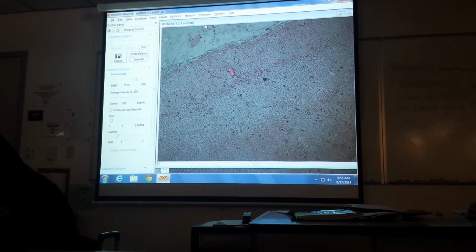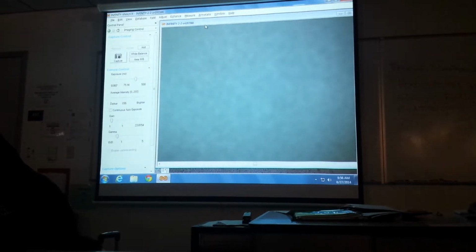Is this cortex or medulla? This is cortex. Which zone is that? Reticularis. What about that one? Fasciculata. These little oval clumps on the top. Glomerulosa. Okay. So what's that? Adrenal medulla. So you guys, at least some of you can see it, and some of you may take a little more time. But that's all I wanted to do for the adrenal gland. Just do the histology today.